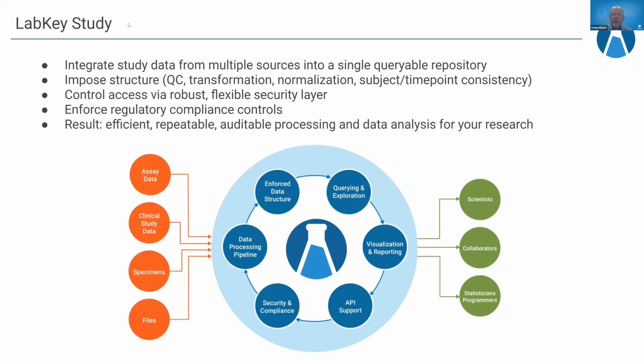So talking about a couple of the key areas of LabKey Server, probably the most important one is LabKey Study. This is the part of LabKey Server that handles study data. It basically integrates a wide variety of study data from multiple sources and multiple systems into a single queryable repository. That's fundamentally what study is doing. And in that process, it is imposing some structure in terms of quality control and appropriate transformations, normalization, ensuring consistency with subjects and time points, putting all of the data within the context of a schedule of events to make it much easier to analyze this data in a controlled and reliable way.